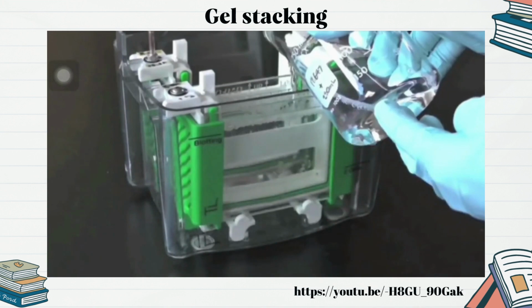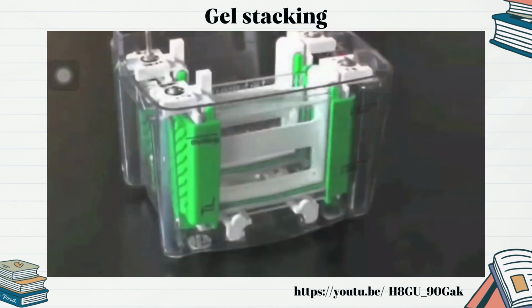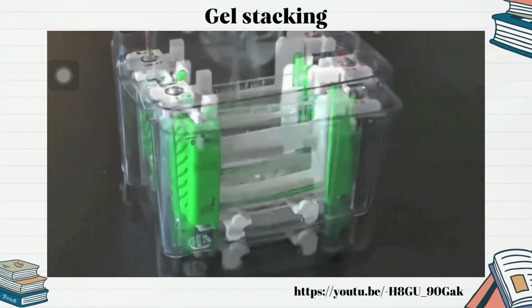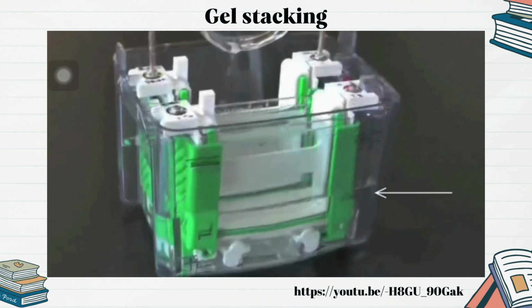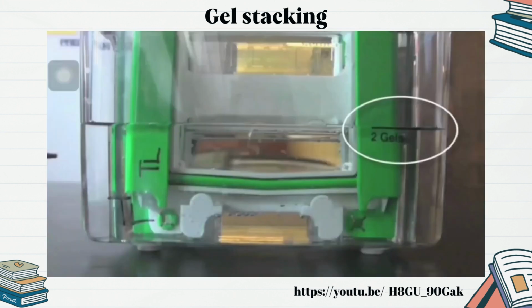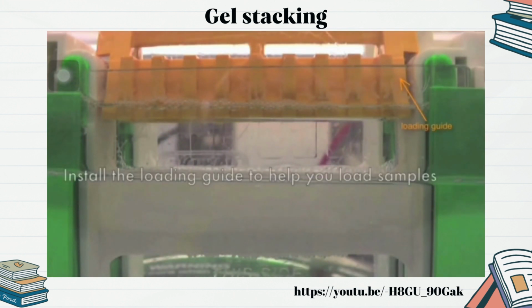Pour the 10 times diluted running buffer solution into the running module until the wells on the 2 plates are fully submerged. Check the running modules aren't leaking. The tank only needs to be filled halfway with the buffer solution if running 2 gels, and it is ready to load the samples. Install the loading guide on the gel to make it easier to load your samples properly into each lane. Carefully load 10 microliters of sample solution into each well.